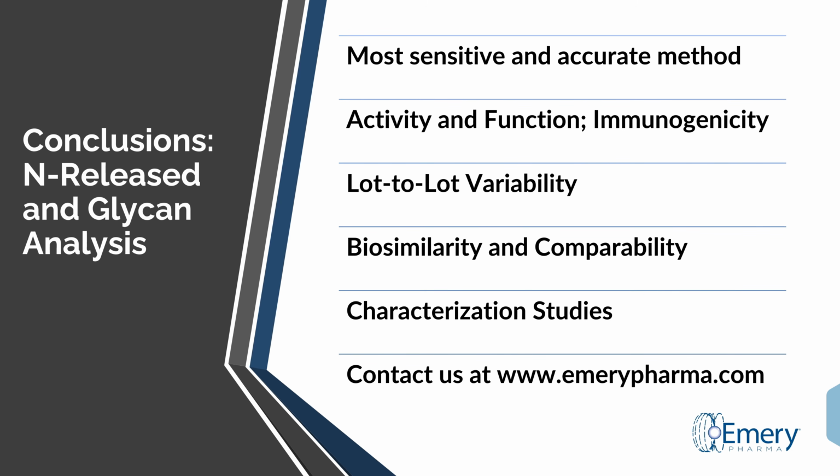While our work utilizes a modern high-field Orbitrap mass spectrometer, the method can be performed with a fluorescence detector, significantly decreasing the cost of the analysis but not the sensitivity.